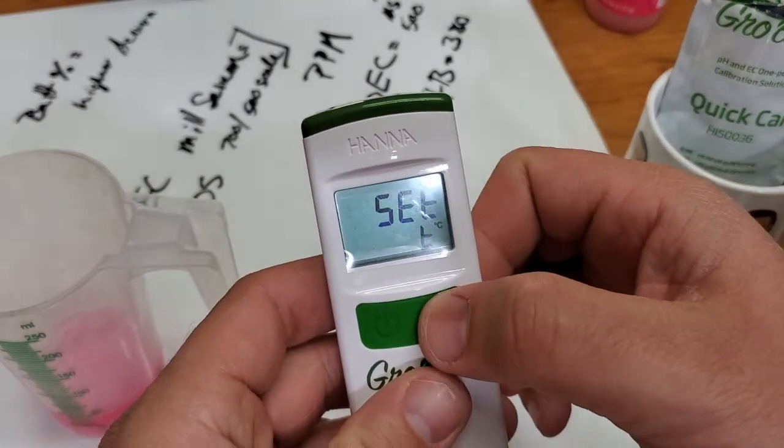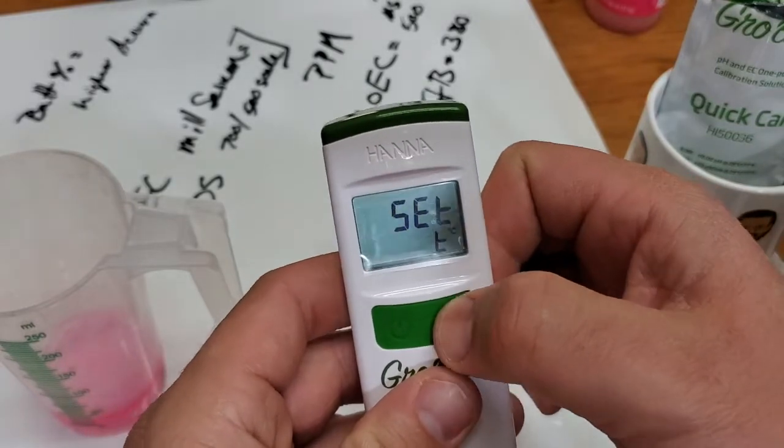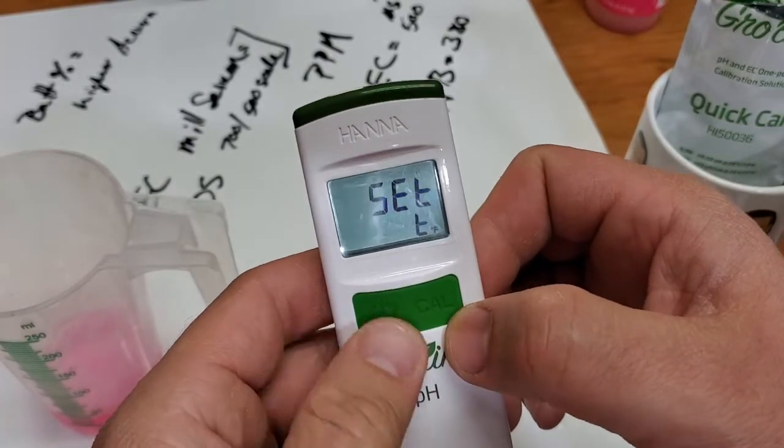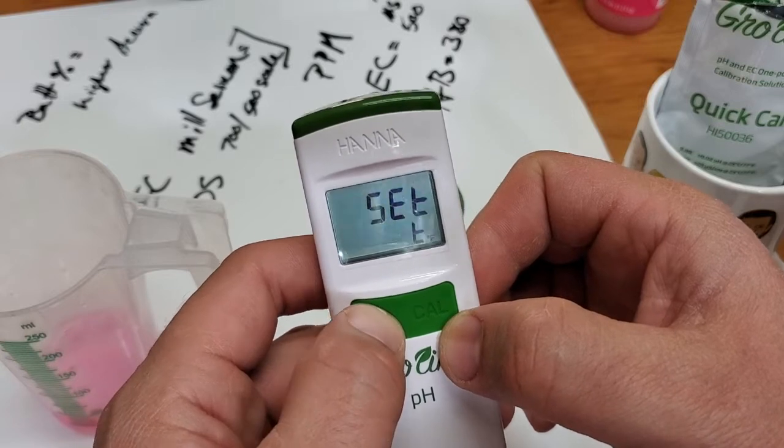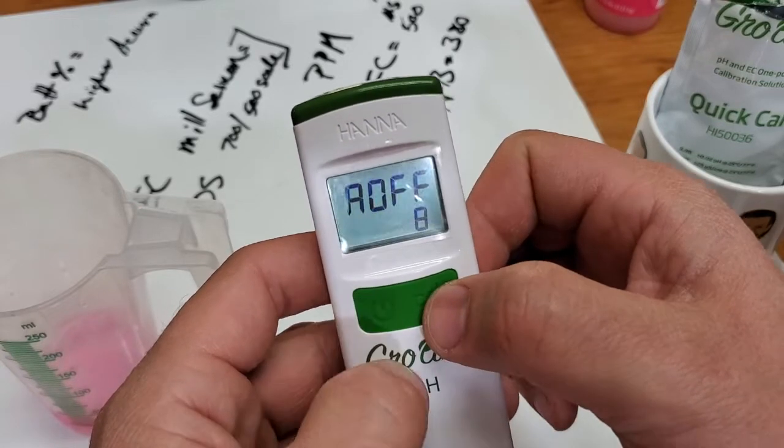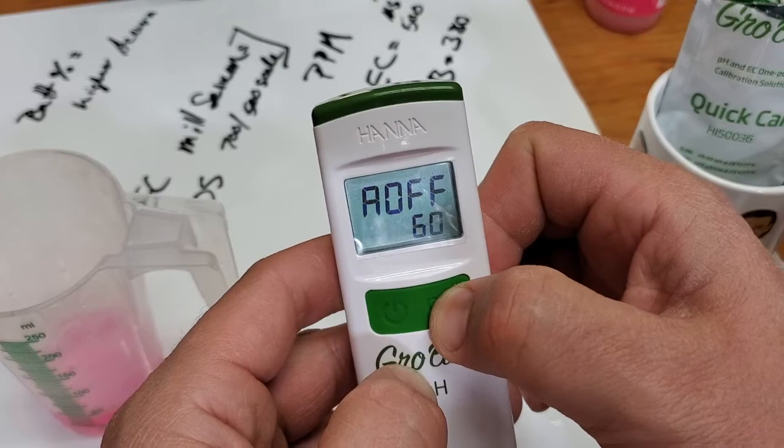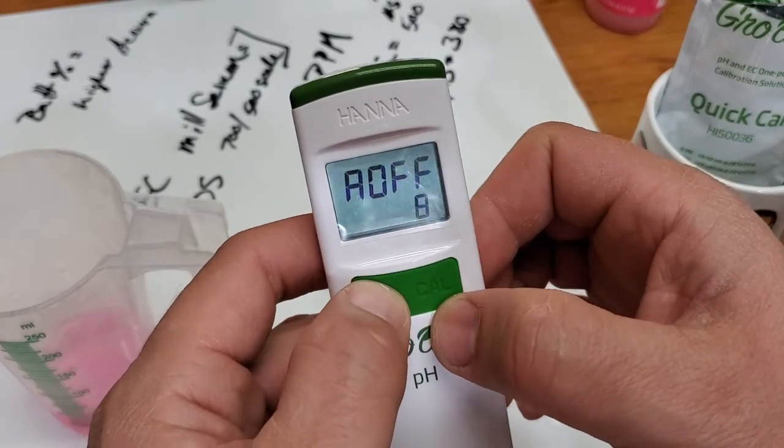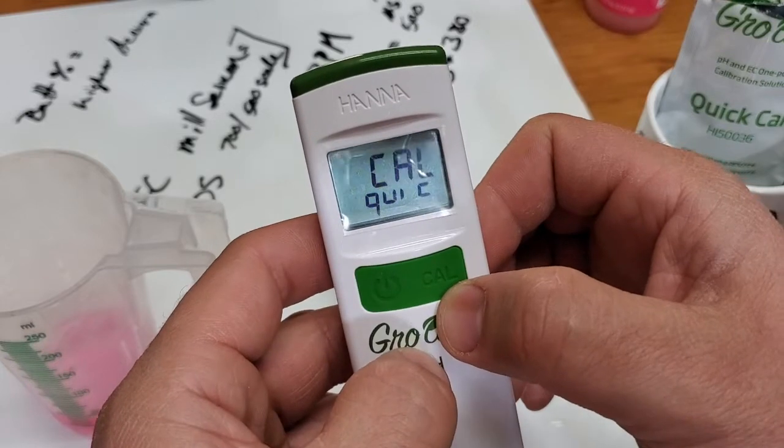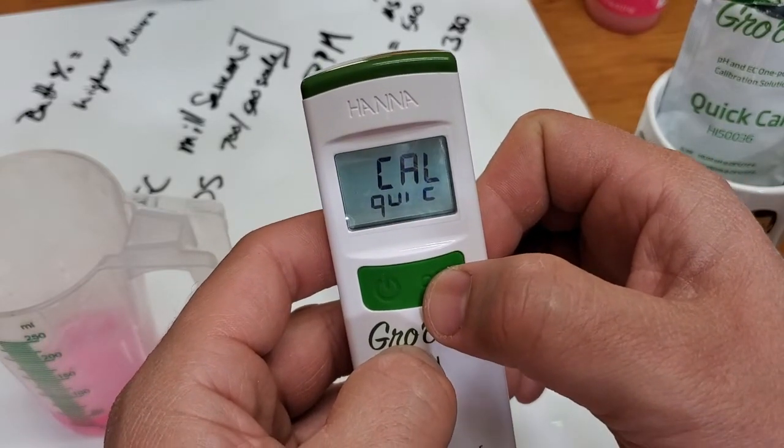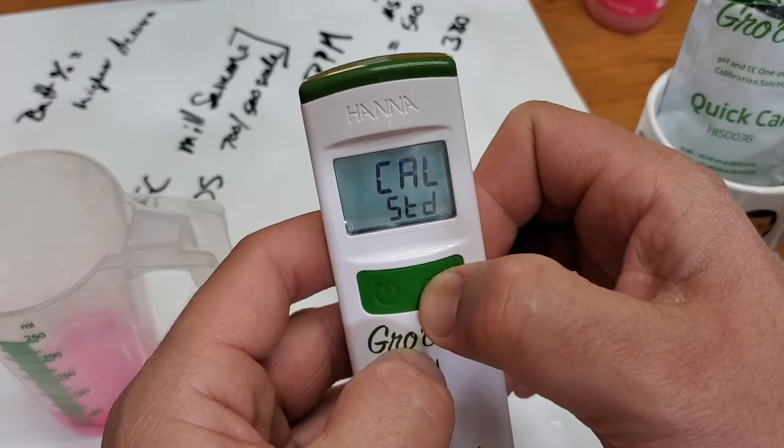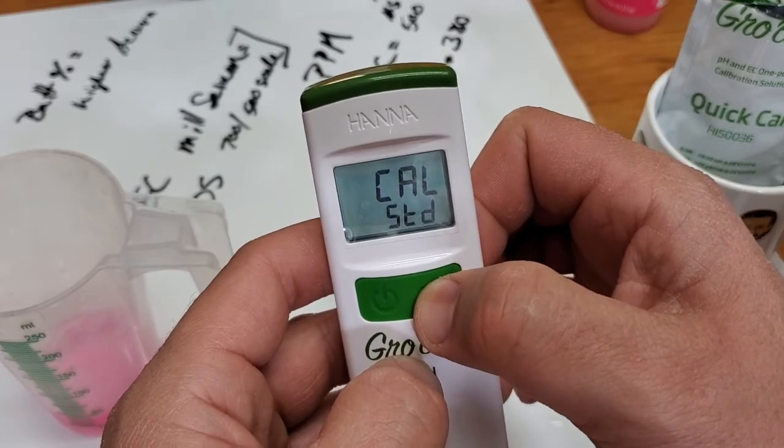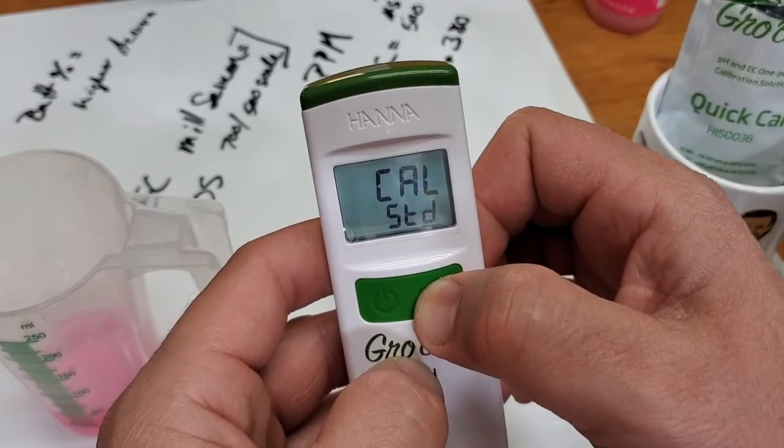Temperature is in Celsius, so we toggle using this Cal button, switch it back to Fahrenheit. Set for auto off at eight minutes. You can set it for 60 minutes or to stay on. We're gonna leave it at eight minutes so it'll timeout. We're gonna do a Quick Cal demonstration, but you can do a standard calibration using four and seven. Leave that on Quick Cal.